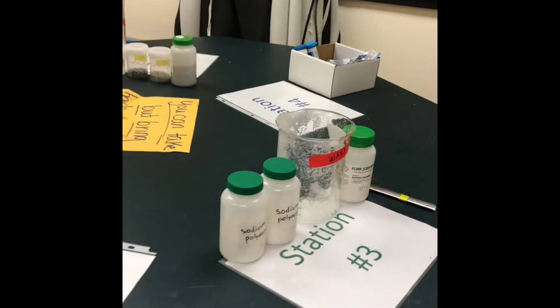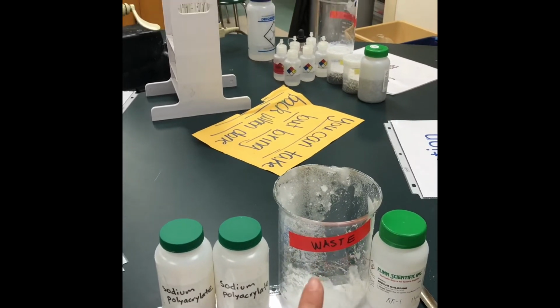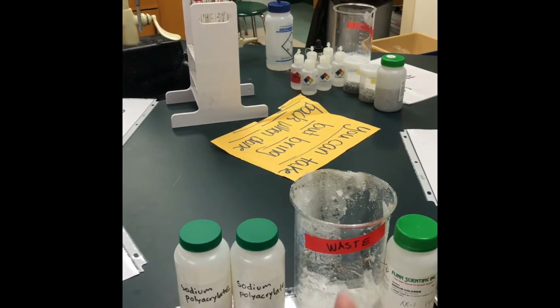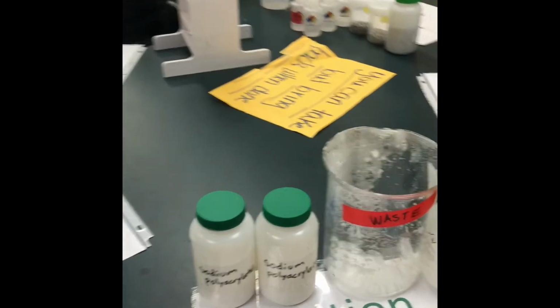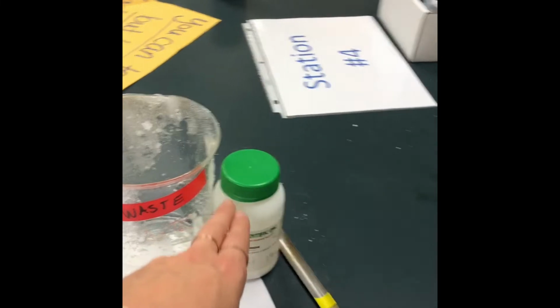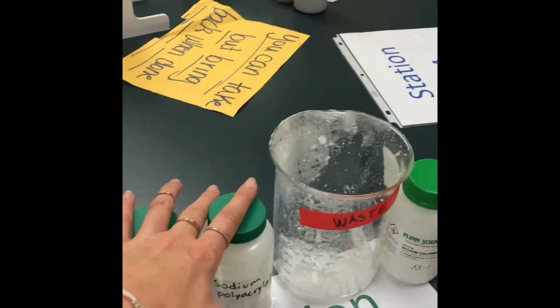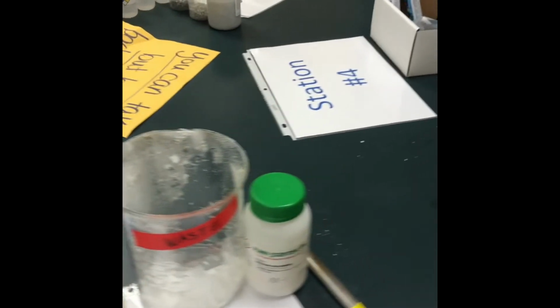Okay, back to our chemicals here. Let's talk about station 3. If you notice, station 3 does have a specific beaker. Again, if you read your procedure, you will see that. Don't just assume. Please read. Also, make sure that you read the bottles. Like if I look here, this bottle looks like this bottle, but they're different things, okay? Remember to recap every bottle and to follow the directions.